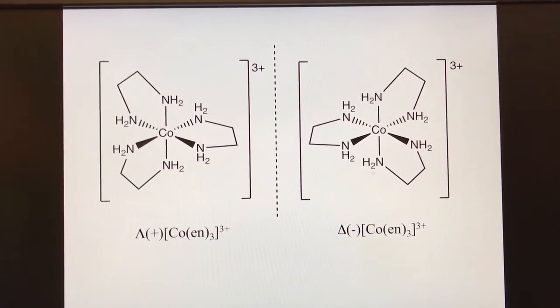All right, so I wanted to again remind you, you've got these lovely two enantiomers that you'll be separating, and you have worked hard to synthesize them, but of course you need to prove to yourself, to get as much evidence as you can, is probably a better way to say it, that you did indeed synthesize these compounds and successfully separated them from each other.